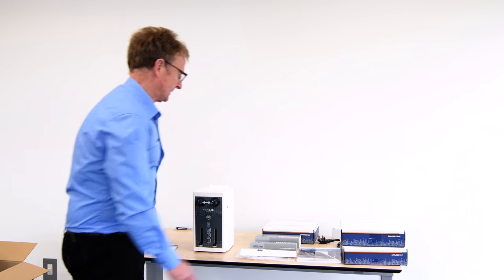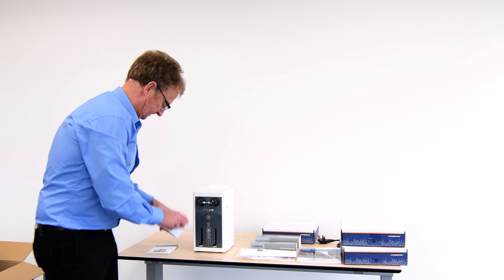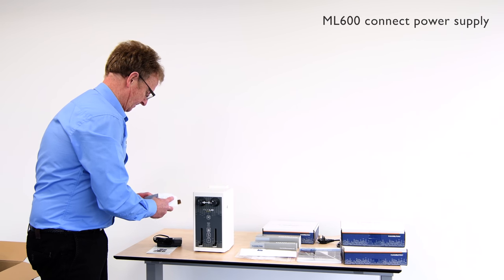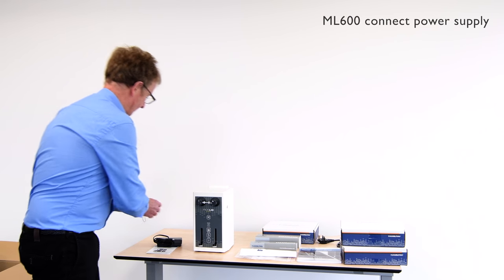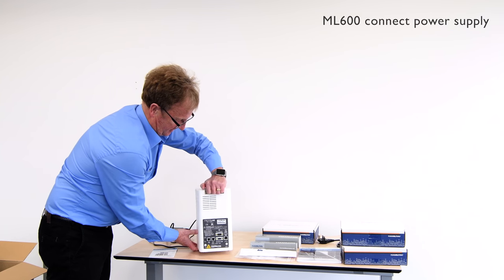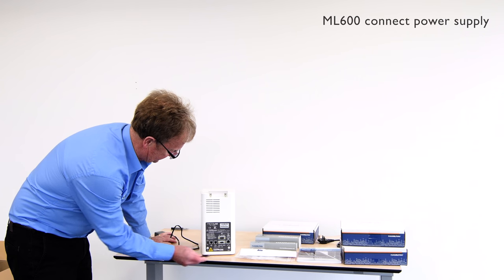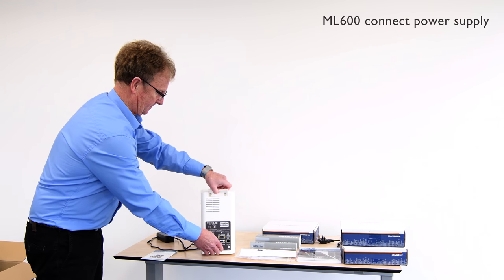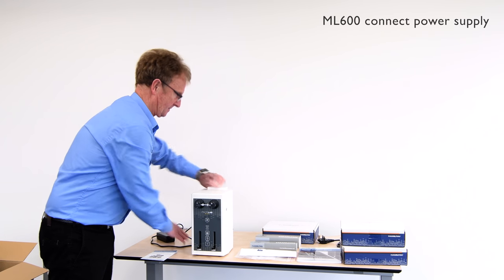First of all we'll take the power supply. The power supply fits into a post on this side here.